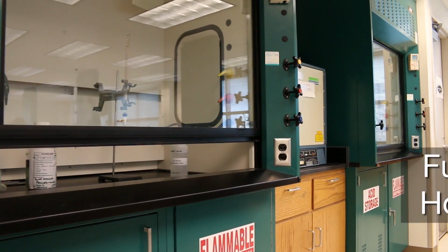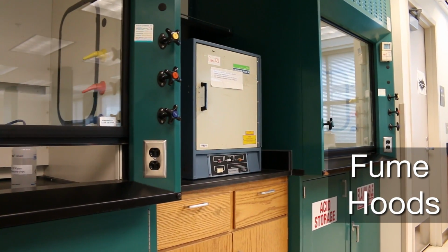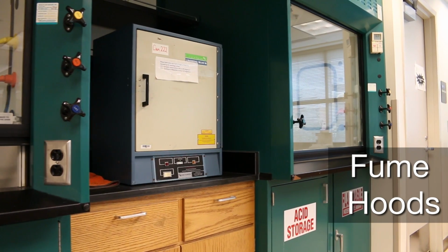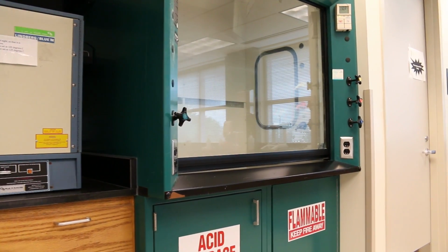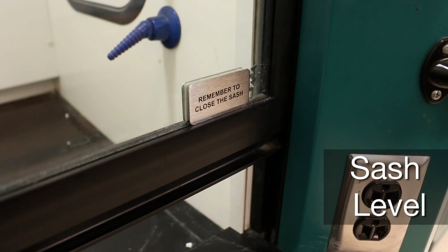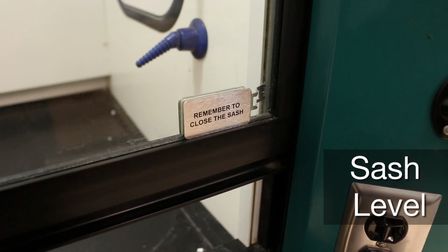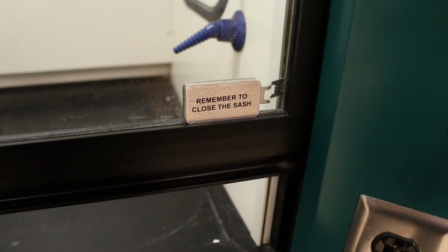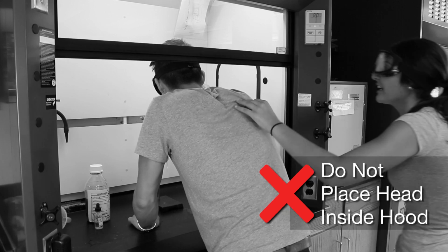The fume hoods are another common space in the lab. Fume hoods draw air from the lab and ventilate it to the outside. The labs get cool or cold because of this ventilation. For this flow of air to work properly, the sash should be at the proper level. Each hood has a calibration mark on the side of the sash. Keep the sash between you and the chemicals, reaction, or vapors. Do not put your head in the hood, even to see something better.